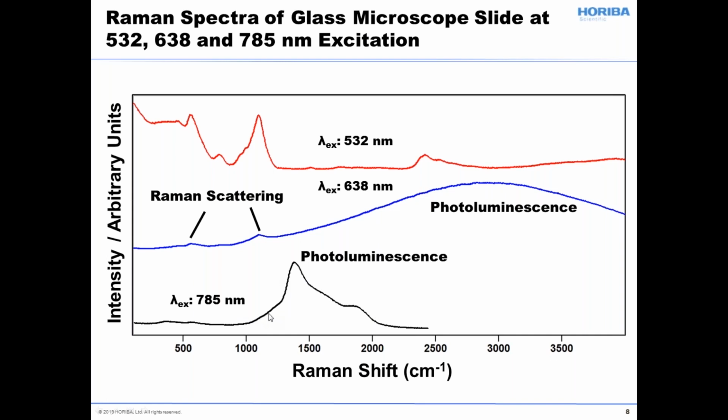So the laser is going to penetrate the material. So if the material is opaque, none of this is relevant, right? Because the laser won't pass through it. But if the materials are transparent, particularly if the samples are thin path length, let's just say, then the substrate, which is so much thicker, is going to contribute substantially to that signal.